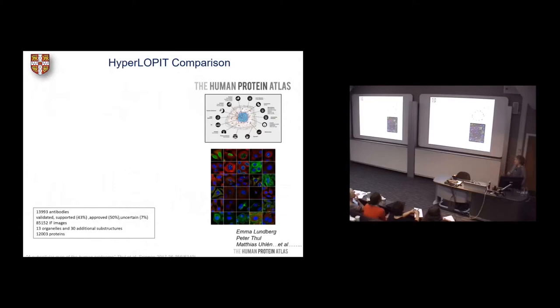Now, over the years we've had to prove and show that our methods are valid and that they make sense, and that what we're not doing, particularly in terms of proteins that are in more than one place, is simply picking this up as an artifact of the methods that we're using to fractionate the cells.